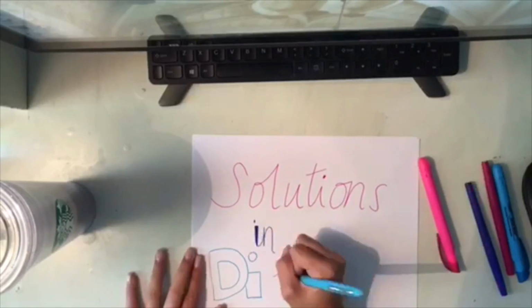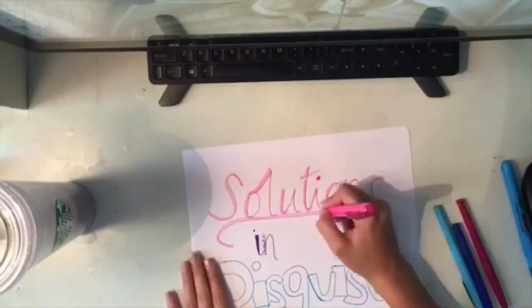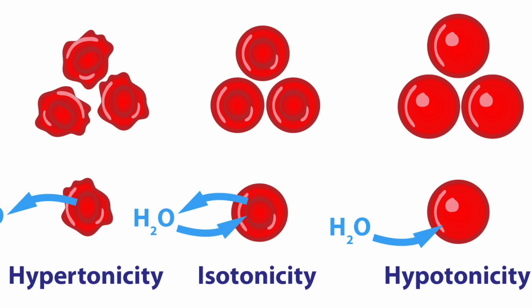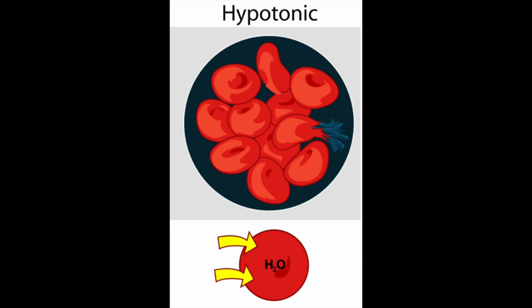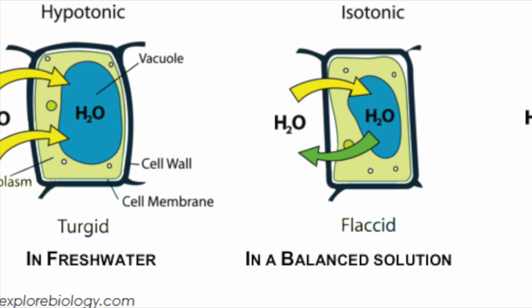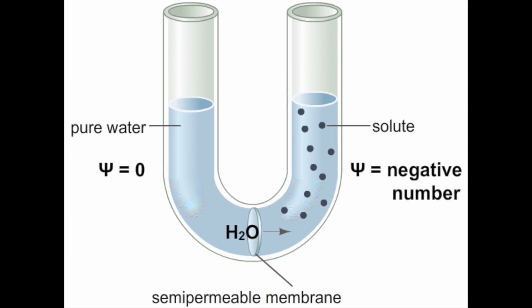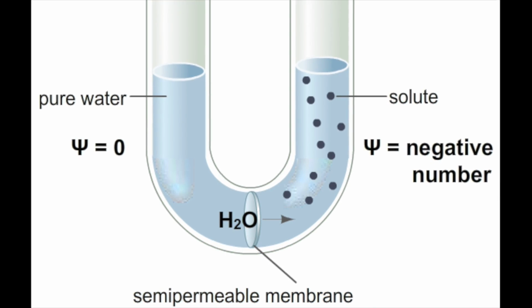In this mysterious solution extravaganza, we discovered the concentrations of various substances based on our knowledge of osmosis as AP biology students. Using disguised substances, we designed an experiment to identify the sucrose concentrations of each colored solution. Based on our knowledge of hypotonic, hypertonic, and isotonic solutions relative to plant cells, our goal was to classify the concentration of each of the substances. The data collected from this lab allowed us to order the solutions according to their estimated water potential.